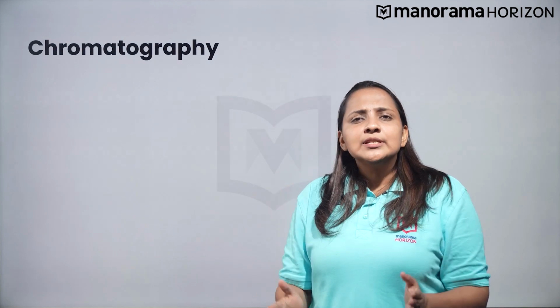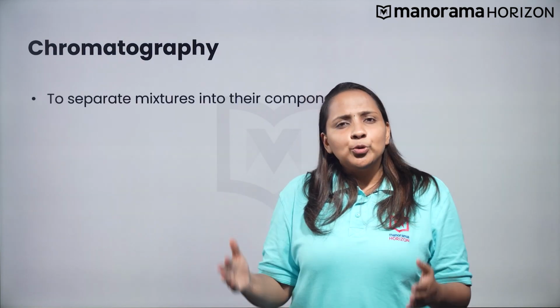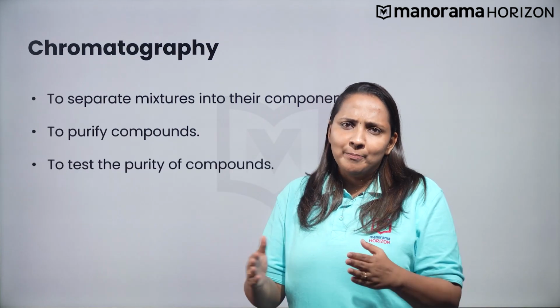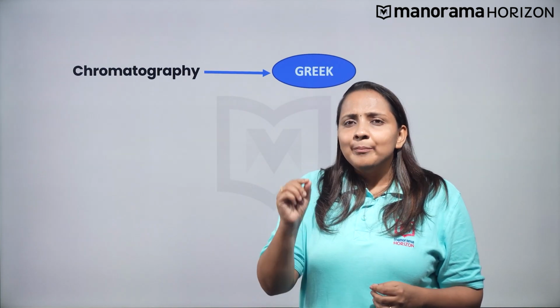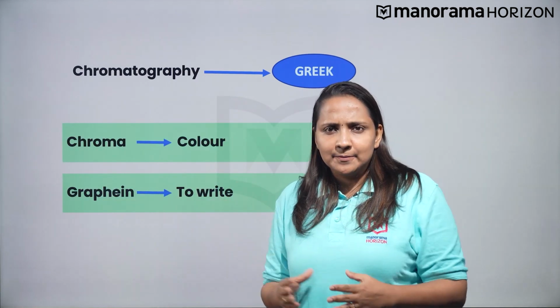Let's discuss an important technique, chromatography, which is extensively used to separate mixtures into their components, purify compounds, and also to test the purity of compounds. The term chromatography was derived from the Greek word chroma, meaning color, and graphein, meaning to write.